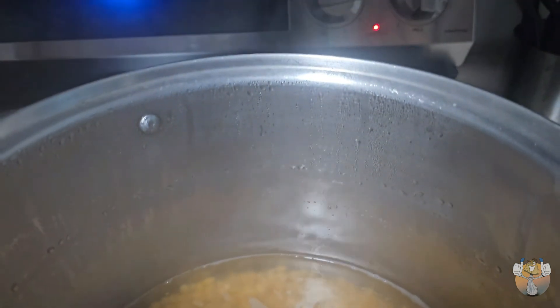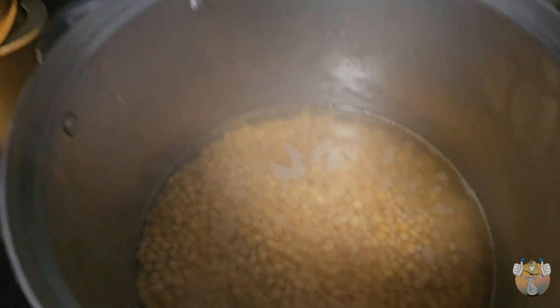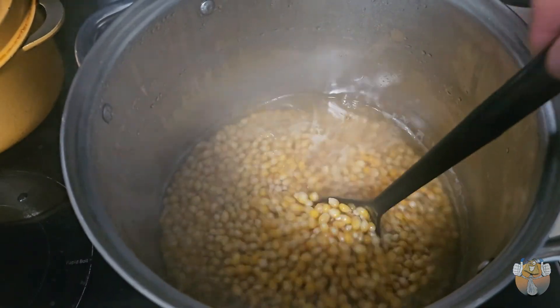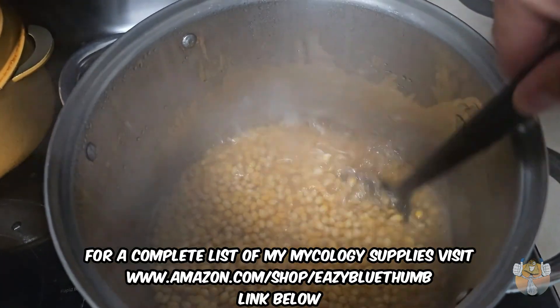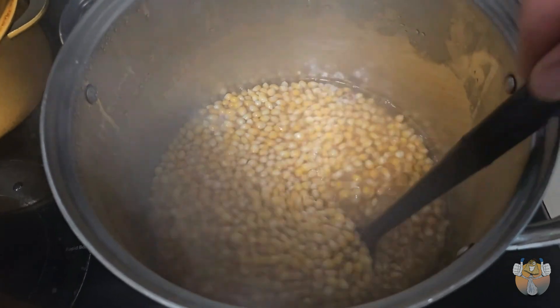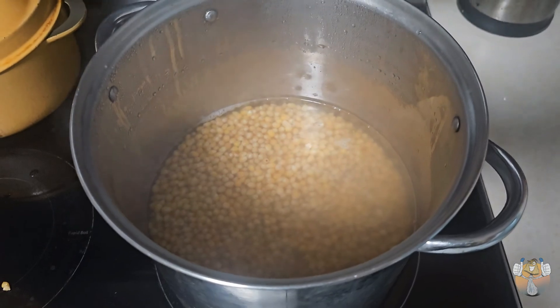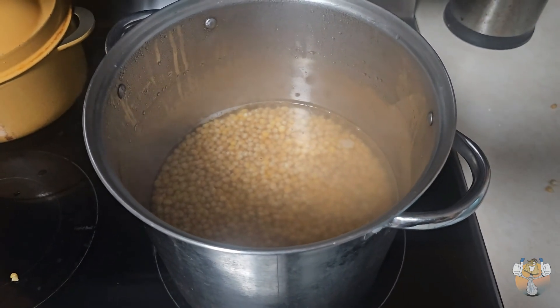We've got our temps on low or medium. Let's give it a stir and we'll let that sit for another half hour to 40 minutes.